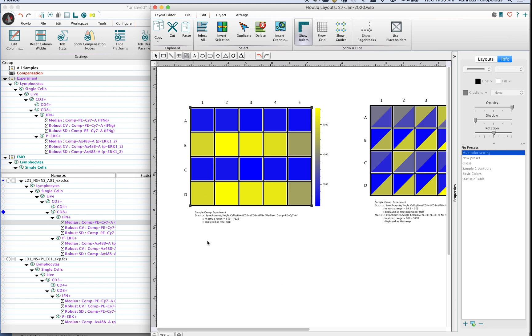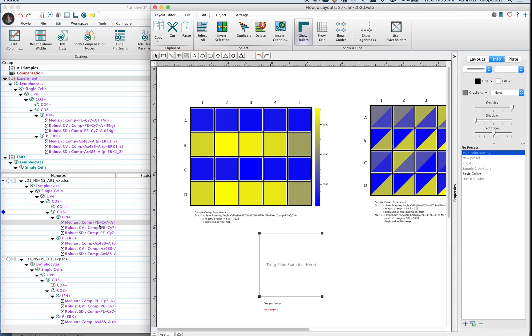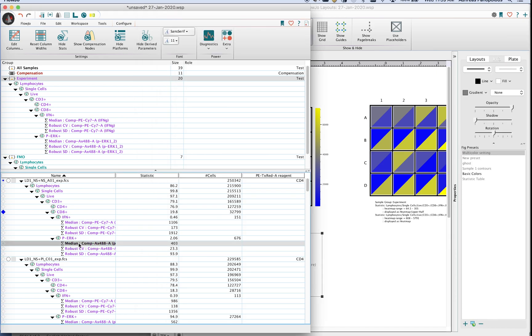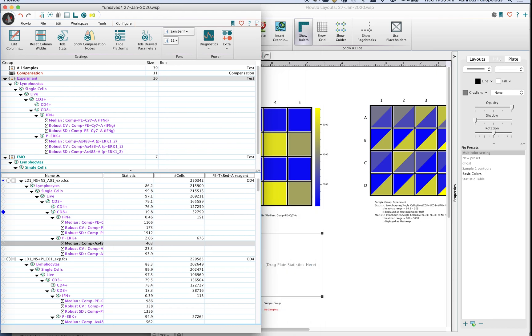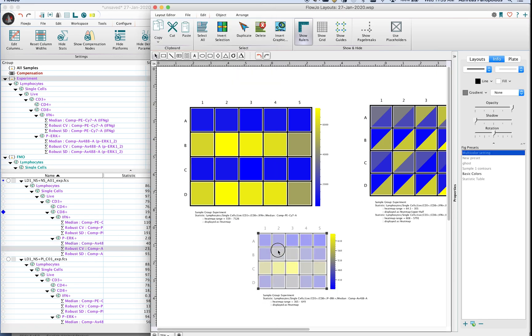So again click on that plate tool then click and drag somewhere else create that plate. I can contrast this maybe to the phosphoerk population that I was also interested in. I'm going to move this just a little bit off towards the left so I can drag that in and see it.